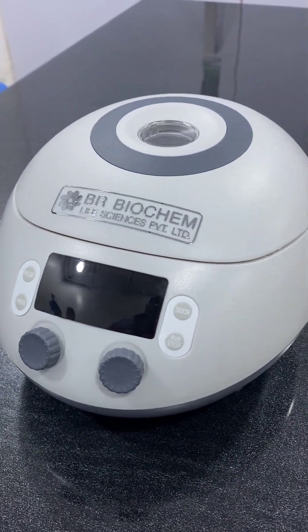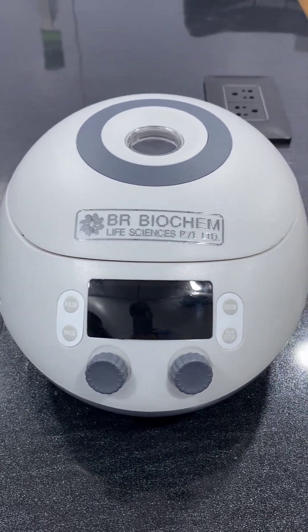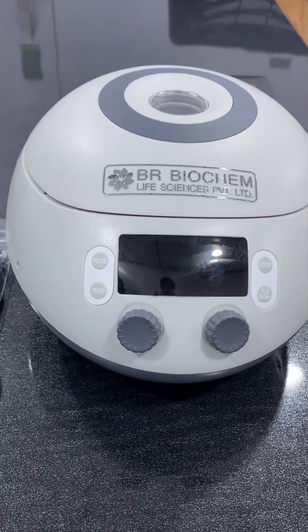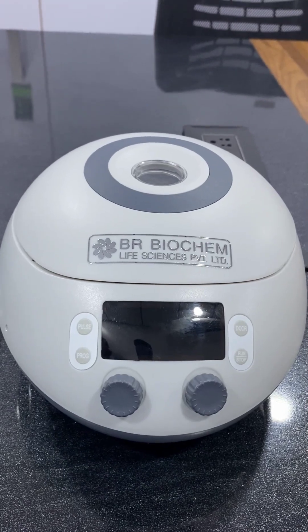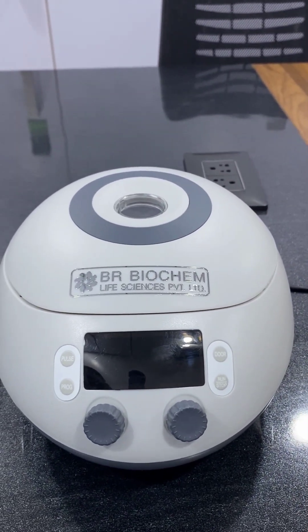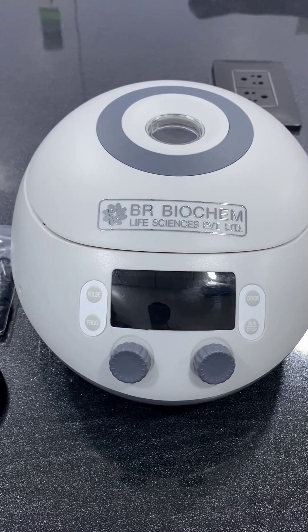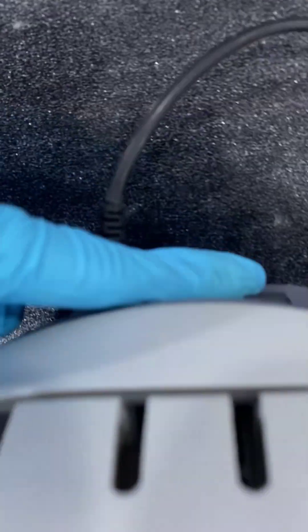You can fit 12 tubes in this machine. A large LED display is also available for easy reading. The centrifugal force is 15,000 × g, and a brushless DC motor is also available in this machine.